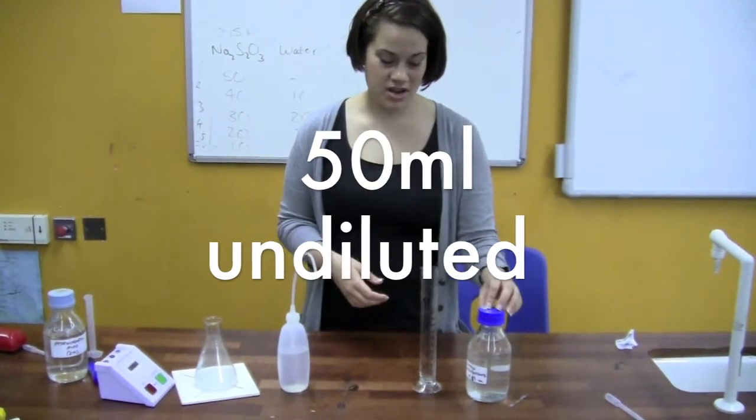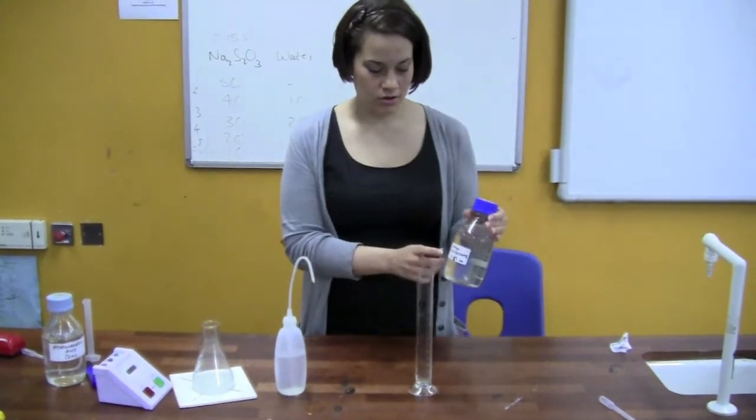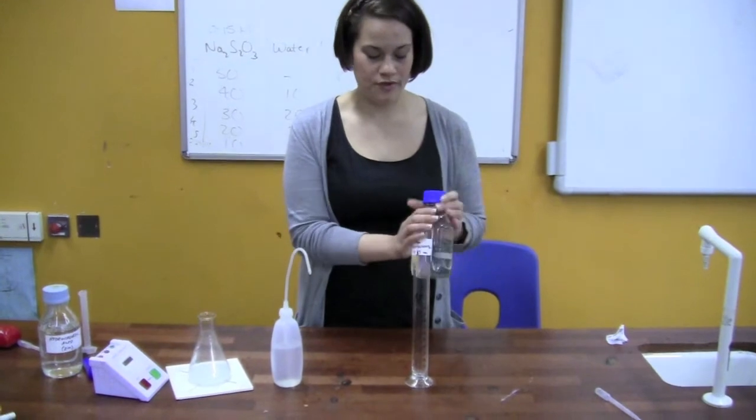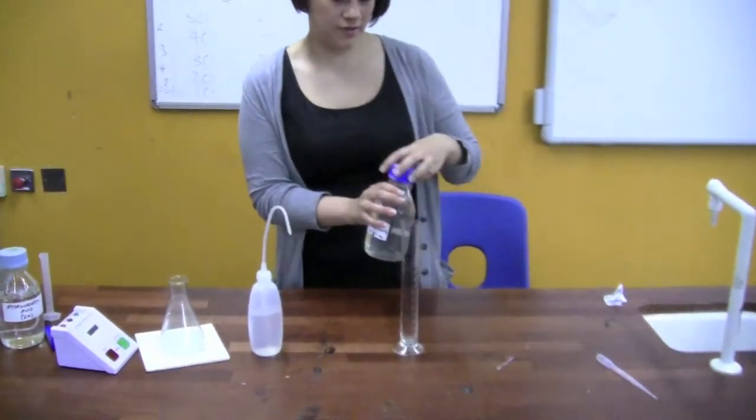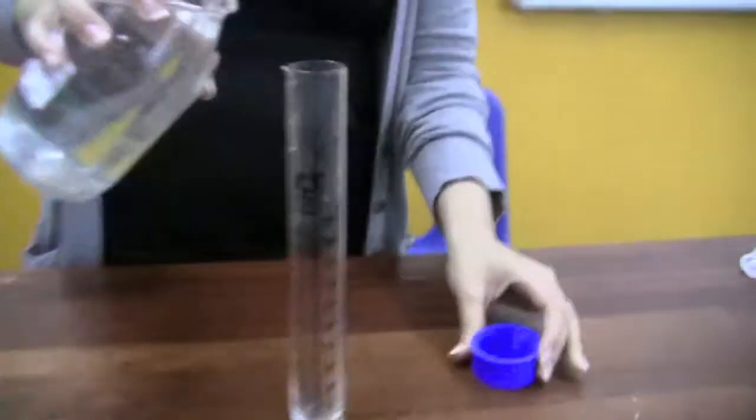For the first concentration, we need 50 ml of the 0.15 molar sodium thiosulfate. So I'm going to start by pouring this in.